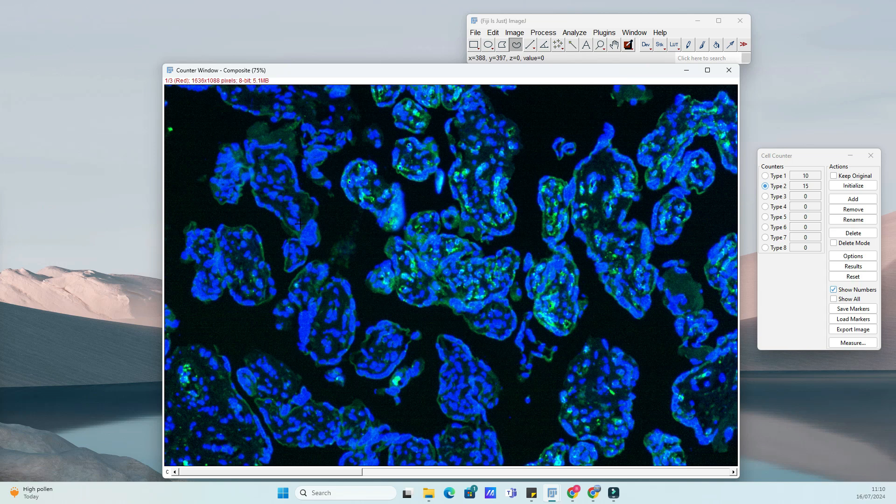Cells are color-coded as you count them, allowing for easy identification and verification.